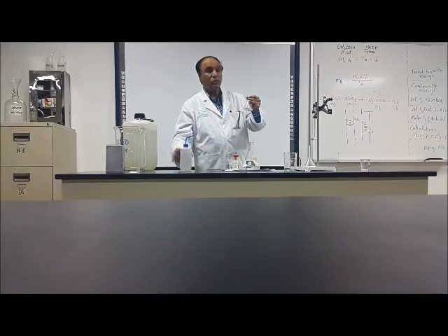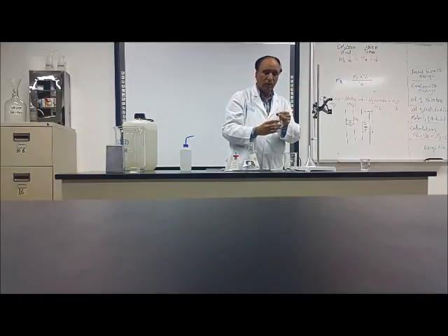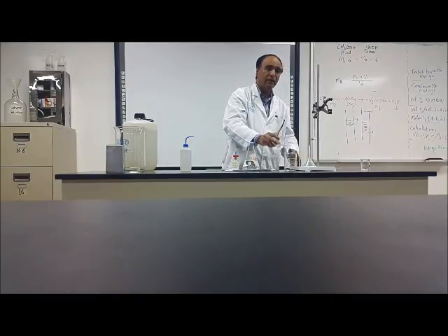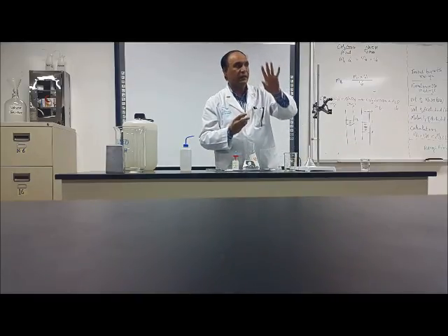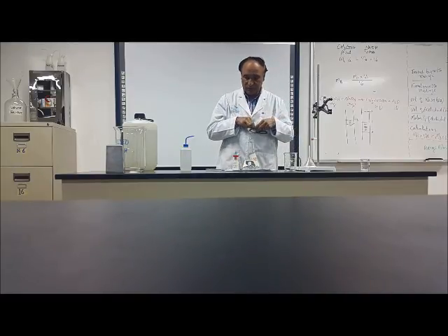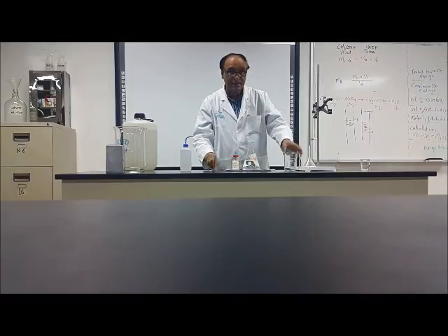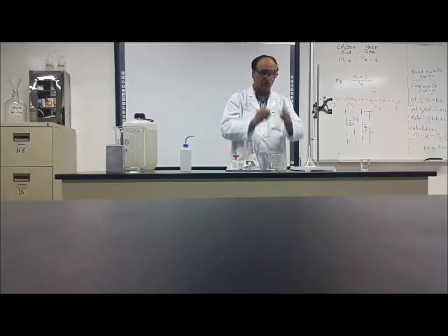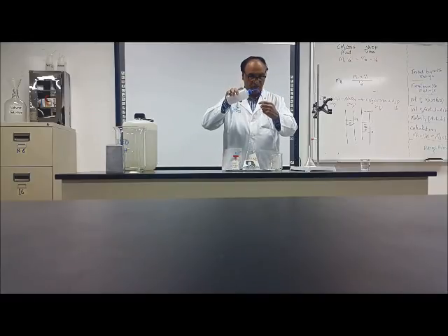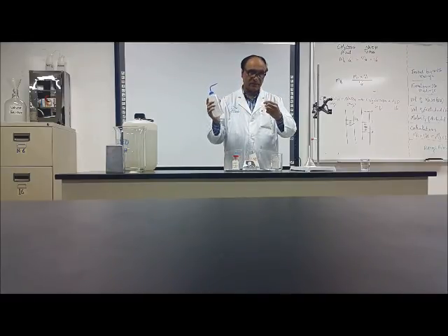And I can throw it there, or I can take another beaker. Not this beaker. I can take another beaker, or I can throw it there, as you like. I will also wash this one with the distilled water. Some distilled water, that's enough.